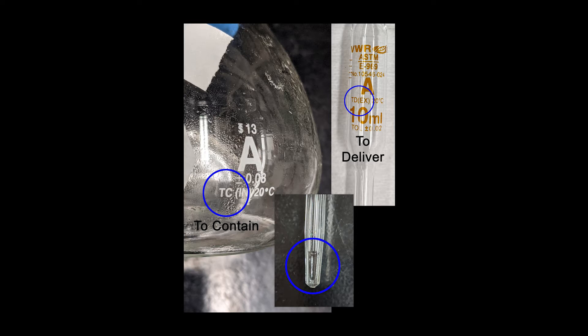Finally, in the third circled image you can see a small amount of liquid remaining in the tip of the volumetric pipette. This liquid remains in the pipette by design and is not blown out. The reason the pipette bulb is removed from the pipette each time when dispensing the standard solution is to allow this liquid to remain in the pipette tip.